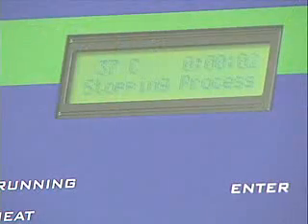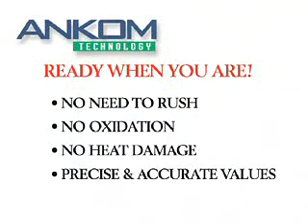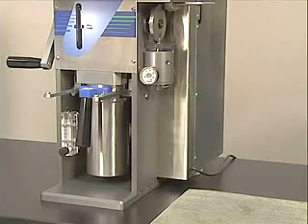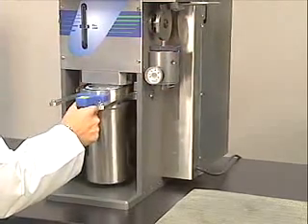When the process is finished, the operator screen indicates that the technician can remove the samples for the final determination. When the process is complete, there is no need to rush to remove the samples. There is no danger of oxidation or heat damage to the sample. Simply remove the samples when you are ready to, whether at the end of the cycle, after lunch, or hours later.